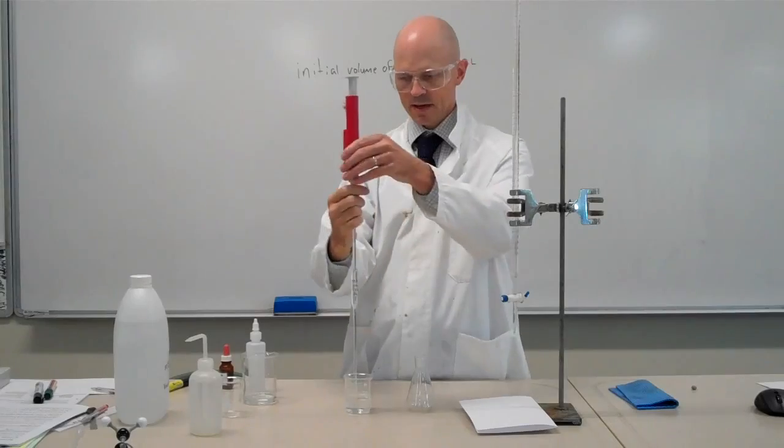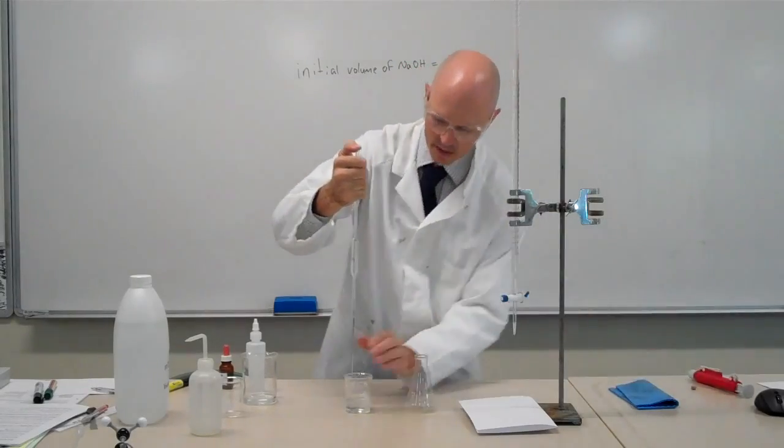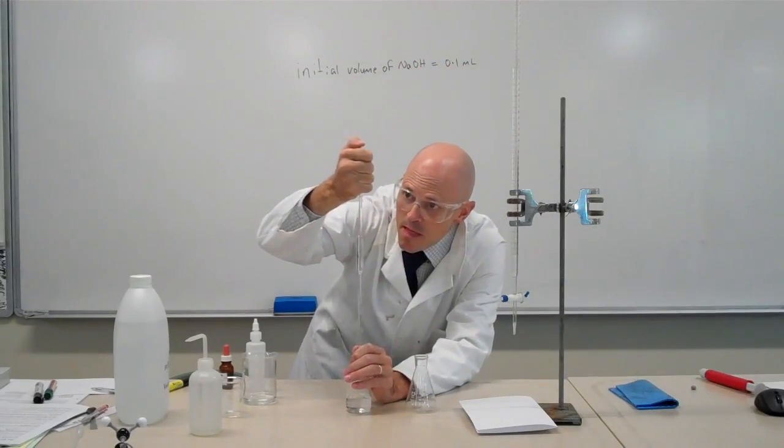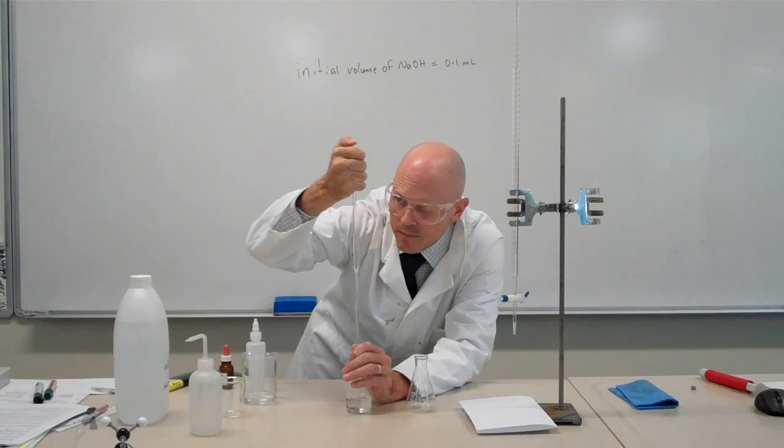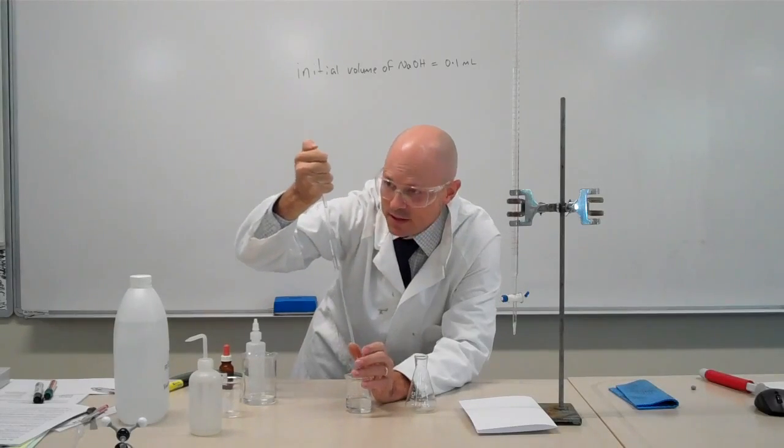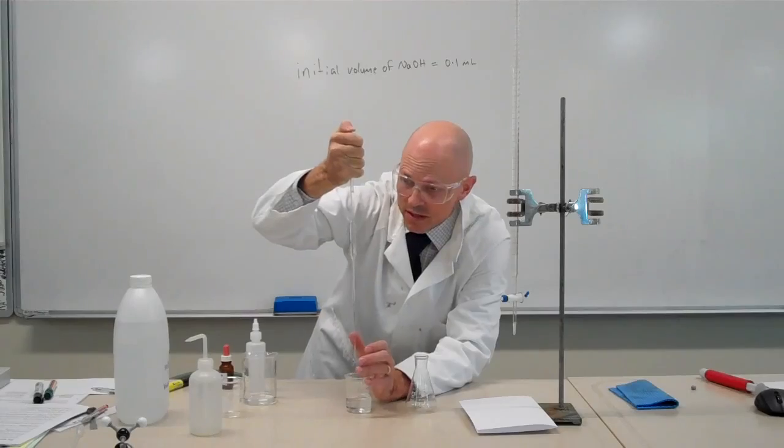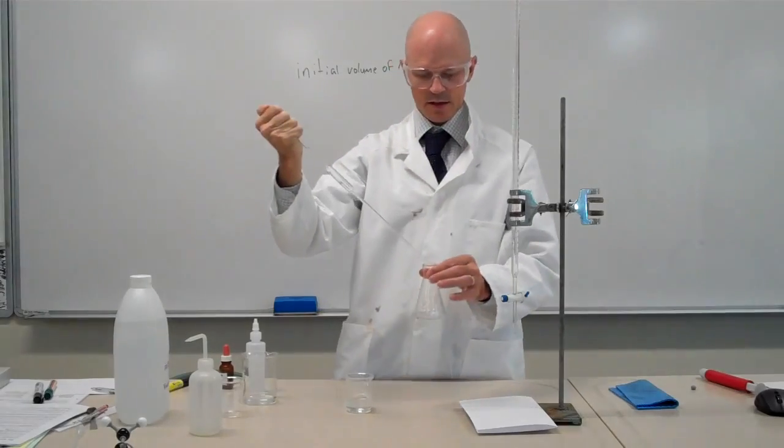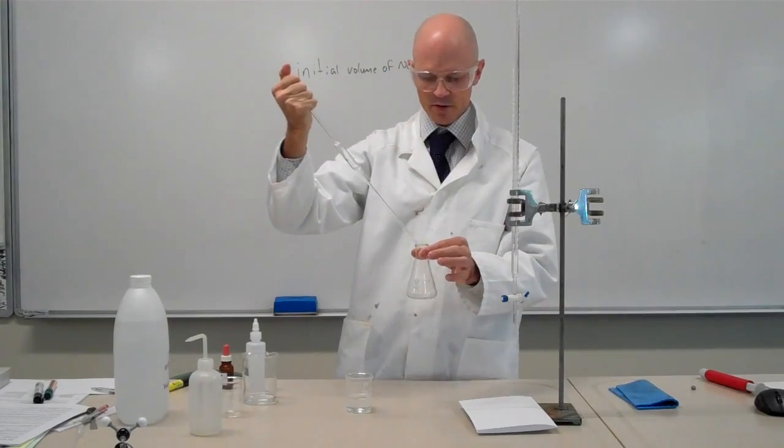Once it's past the mark, just take off the pipette puller. Use your thumb. Make sure you don't have any parallax error to get the meniscus, bottom of the meniscus on the line. And you can add that to your conical flask.